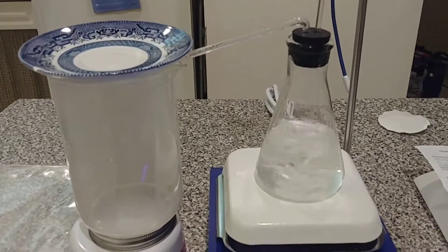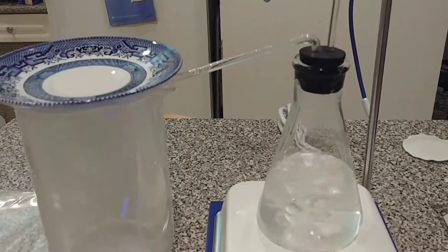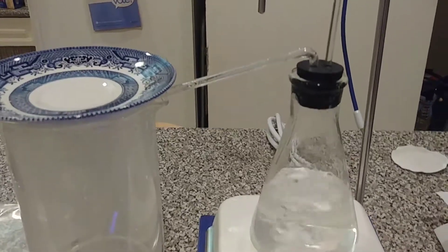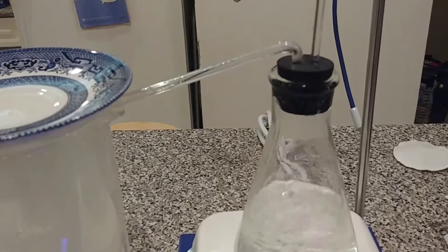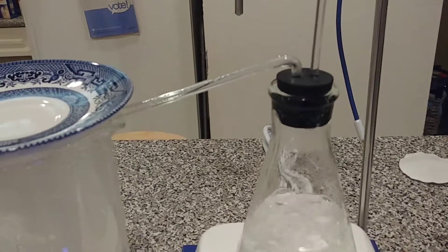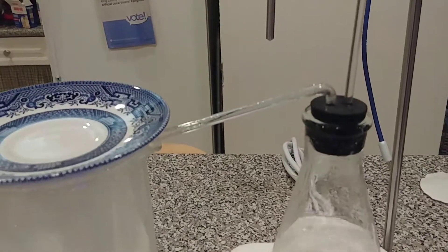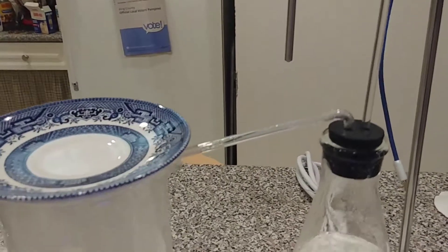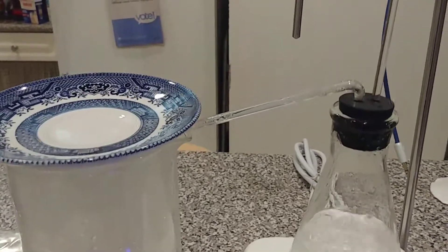My glass tubing is slightly too thick, so after I made the bend in this piece for the distillation tube, I heated up the bottom part that goes inside the stopper and let it stretch out — let gravity pull on it a bit. It's not perfect looking, a little warped, but good enough for testing tonight.